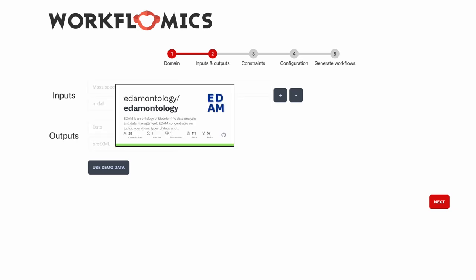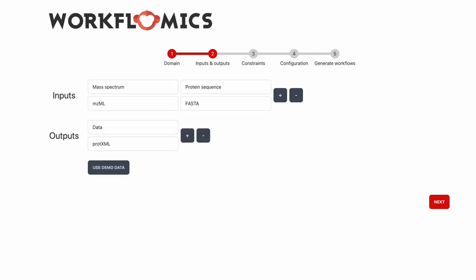The first step in describing our problem is specifying the inputs and the outputs that we have. We rely on EDAM ontology to describe the data types and formats. So in our example we have two files as workflow inputs. One is a mass spectrum in mzML format and the other one is a protein sequence in FASTA format. And as an output we expect any data type as long as it is in protXML format.